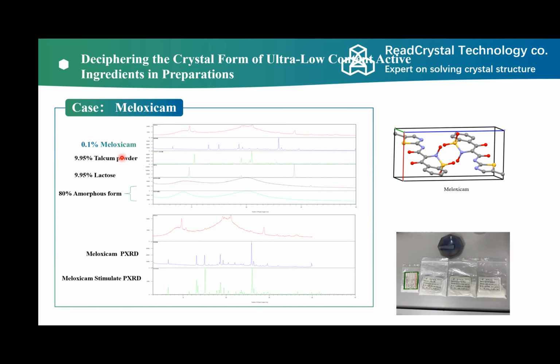But with micro-ED, we have detected a minor phase contained as low as 0.1%, and maybe a lower content can also be detected, because you can screen all the particles in your sample and select anyone you are interested in, and so determine the structure of that particle.